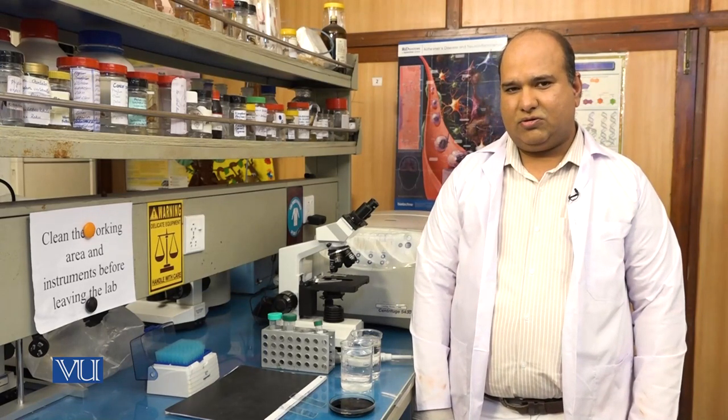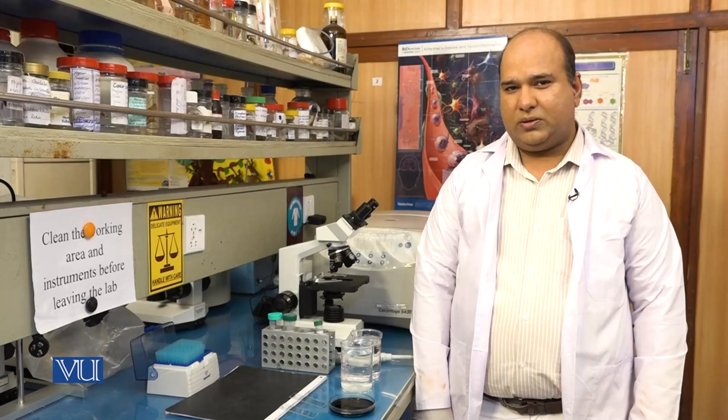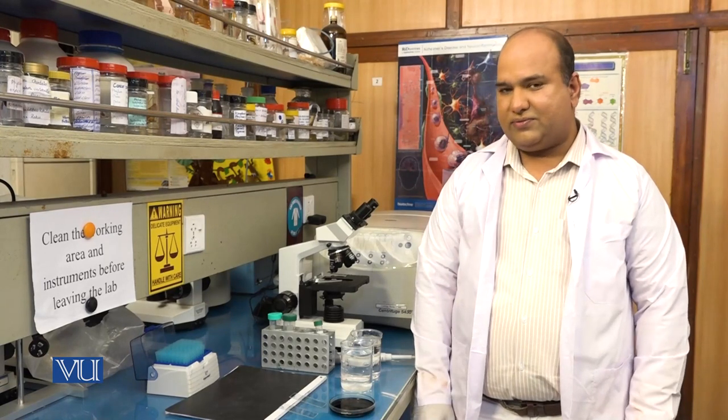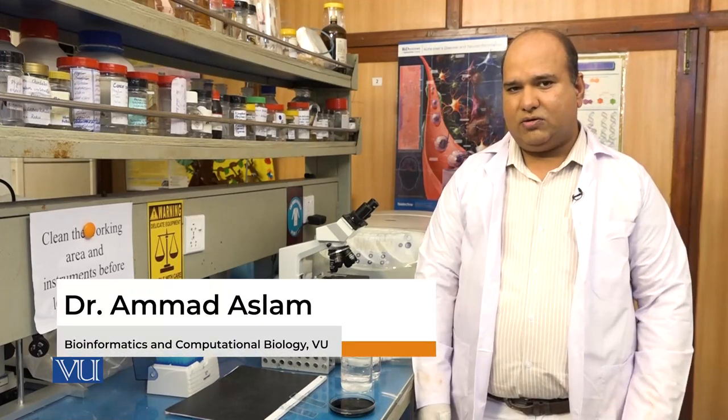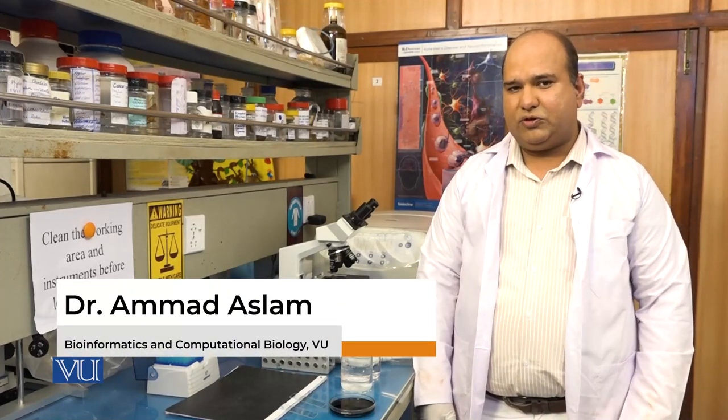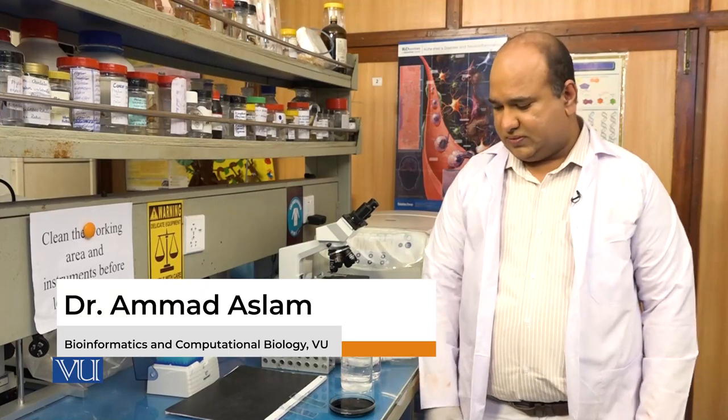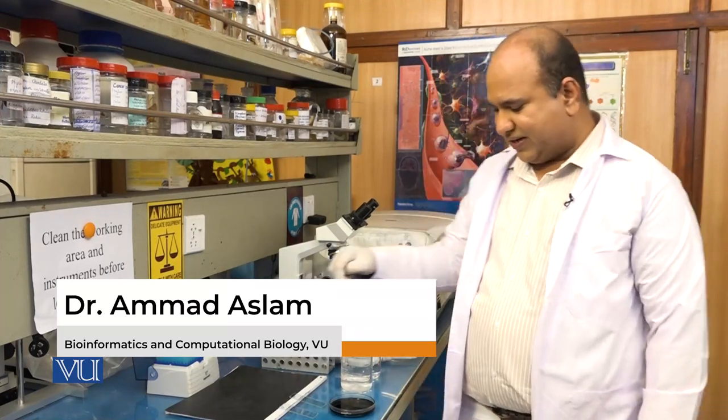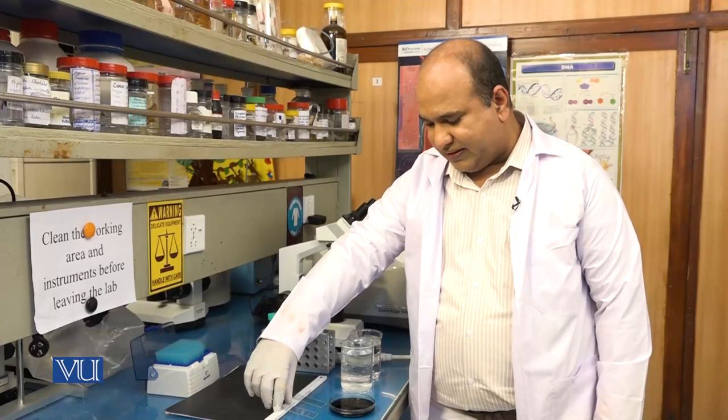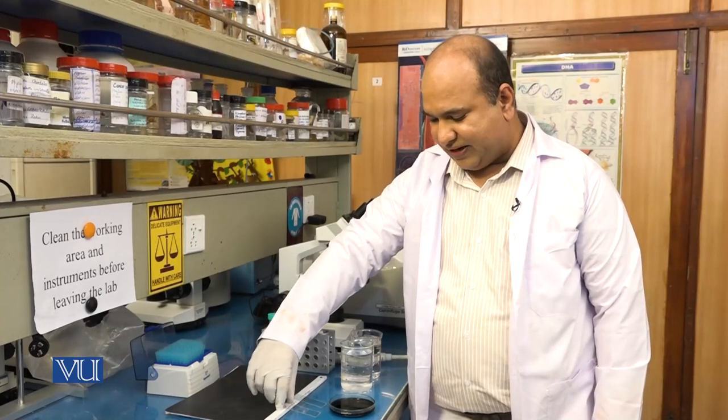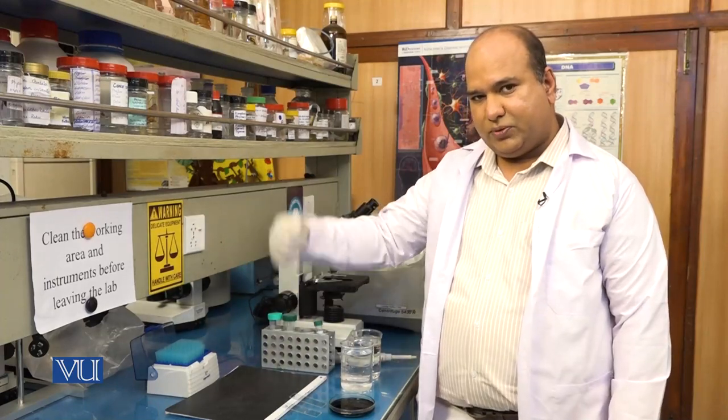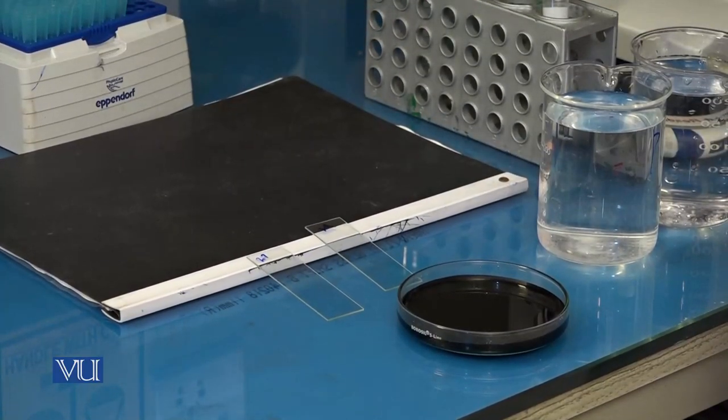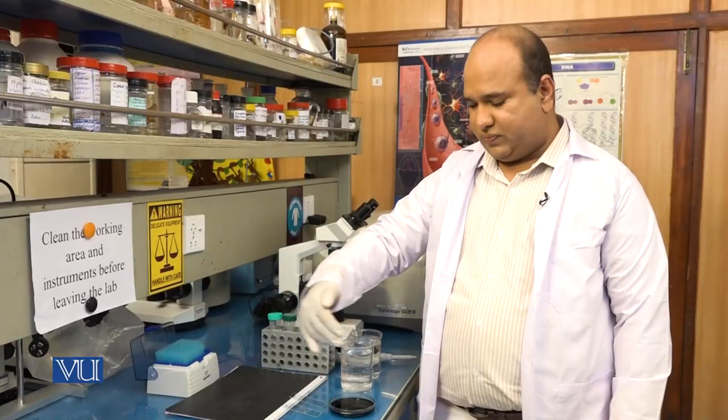Students, this is the last stage of the chromosomal preparation steps, the very final step known as slide preparation. We will now prepare the slides for visualizing the chromosomes. You can see we have the slides here. Keep in mind the slide should be in this tilted fashion so that when we put the cells on the slides, they can easily move along the length of the slide.